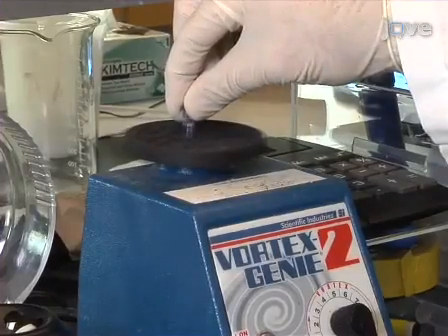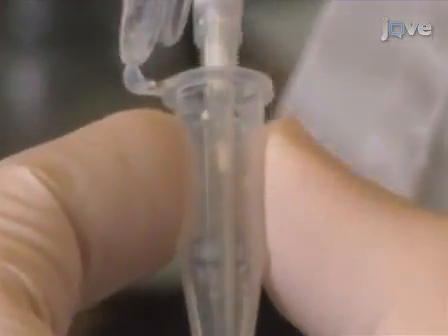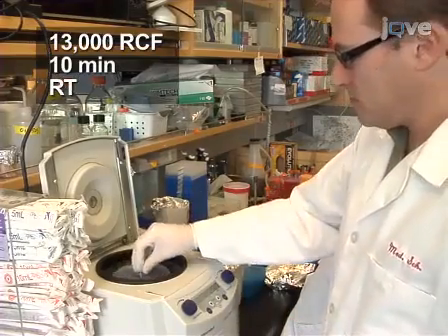Vortex the dye concentrate for 10 seconds and add 1 microlitre to a 65 microlitre aliquot of filtered gel. After vortexing the mixture, centrifuge at 13,000 RCF for 10 minutes at room temperature.